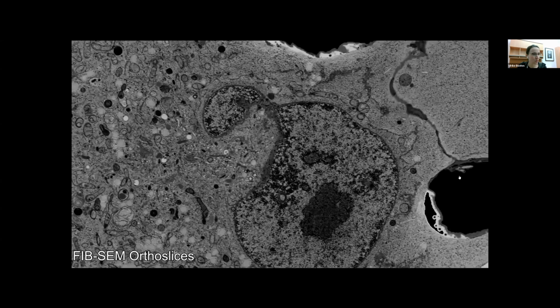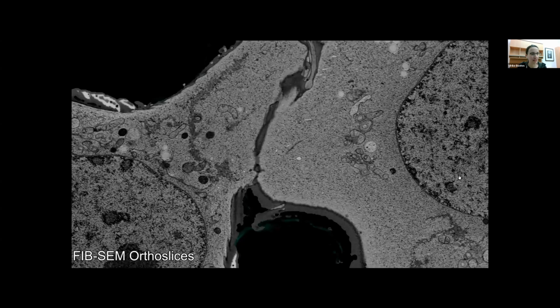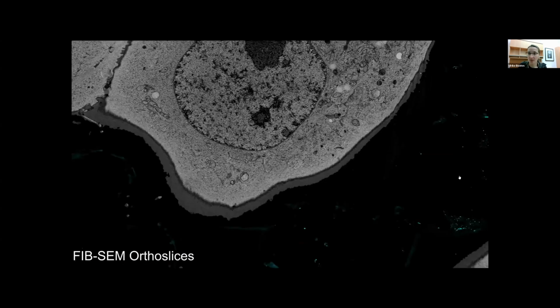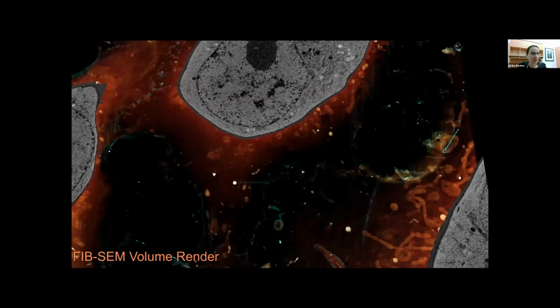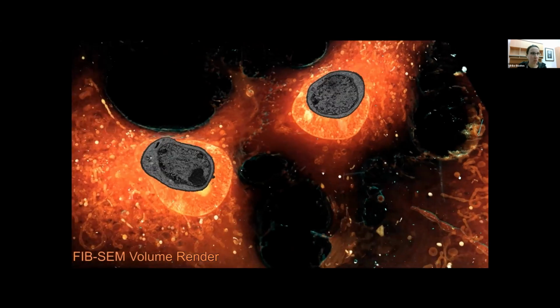But when we go further into detail, one can see that they were also able to correlate this with the respective cryo PALM data set as well, in order to have the specificity.